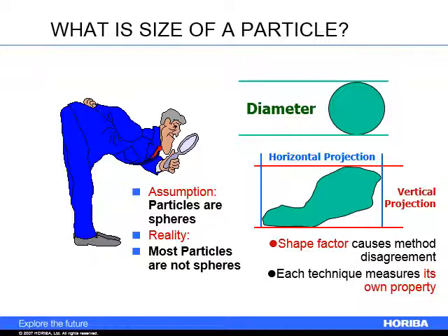You can use the particle size data considering the spherical shape, and that will allow you to compare different processing and different milling behavior. But if you want to know if you've changed the shape, you're going to need to look at the particles. So this is just something to think about as you do it.